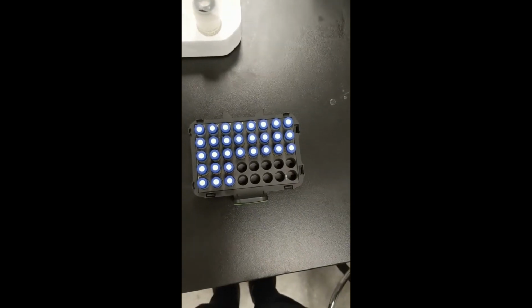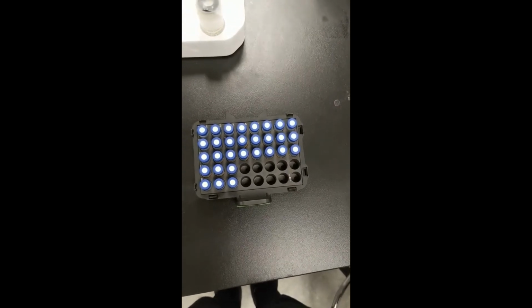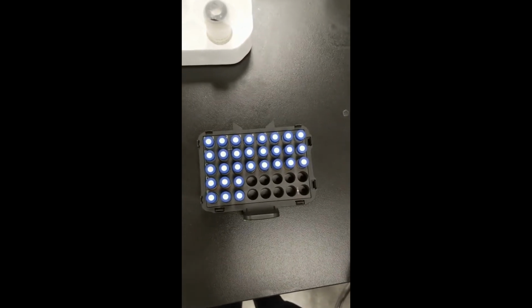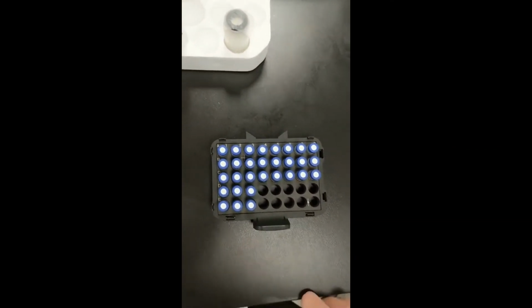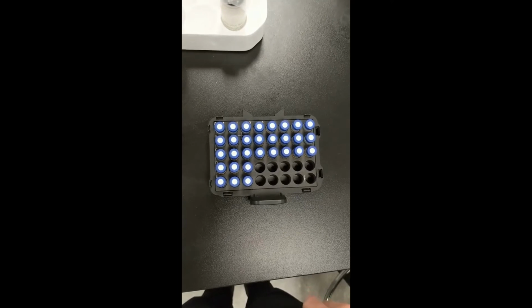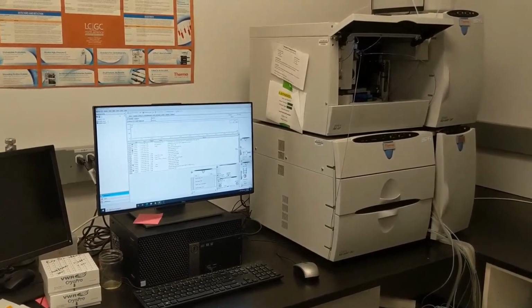So you might be thinking, if I can't put tape on them and I don't want to write on them in Sharpie because I'm going to reuse them, how should I remember where my samples are? Well, write it in your notebook. Write in your notebook which sample is in which position. That's the easiest way to remember where you put your samples.